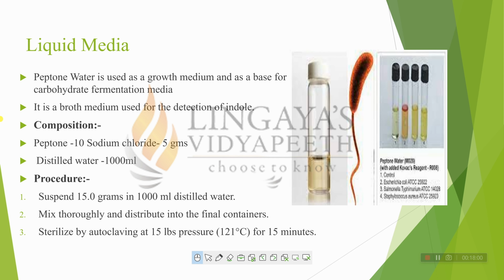For liquid media, an example is peptone water. Peptone water is generally used for growing bacteria and as a base for carbohydrate fermentation media. It is a broth medium which is also used for the detection of indole.